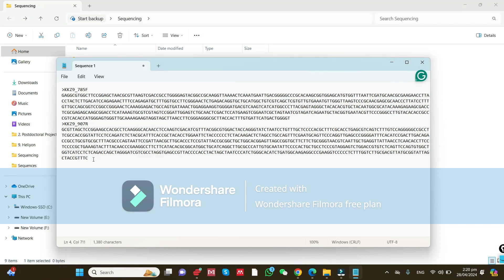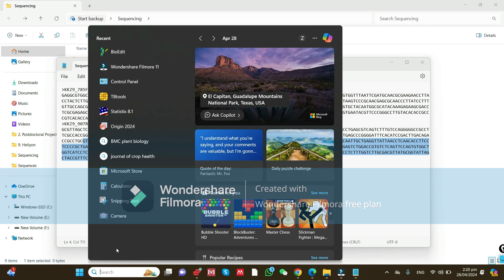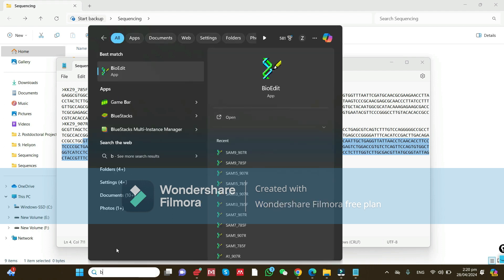Hello viewers. If you have a forward and reverse sequence, here is how you can use them to develop a consensus sequence. First of all, you need to install BioEdit on your computer — Windows or MacBook.